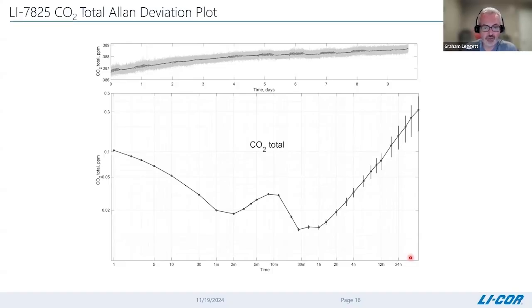So they're not actually measured. So any deviation from that in the sample could affect the reported CO₂ concentration. But with this instrument, because we're measuring those 4 isotopologues, it does provide you with a much higher degree of precision, particularly in samples where there could be unnatural variations in C12 and C13 isotopes.